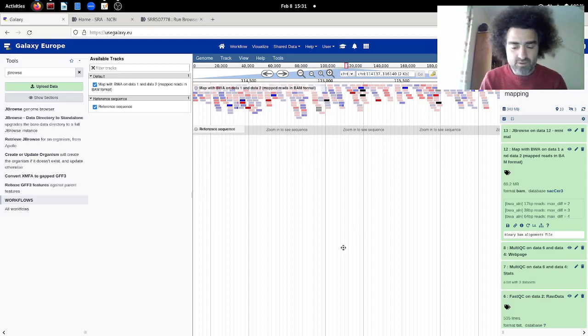Okay, and with that we finish this part of the lecture. Just to summarize what we said in this small video, we performed the mapping with BWA, and we visualized the mapping either immediately as a SAM file, or in IGV, or in JBrowse. Thank you very much.